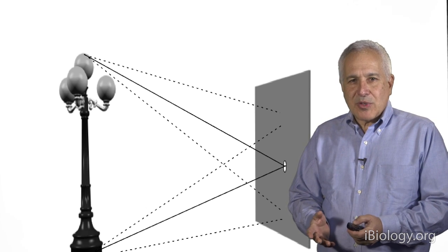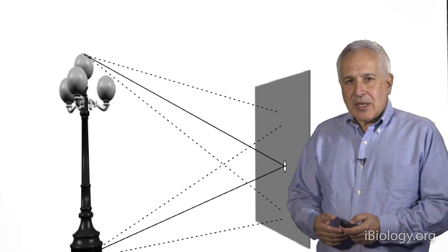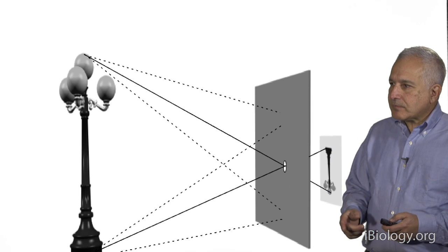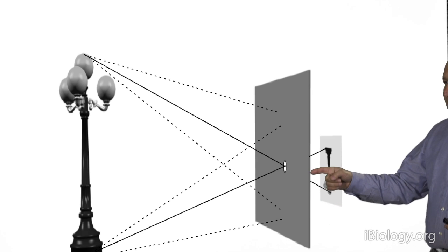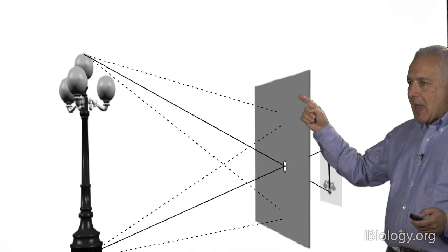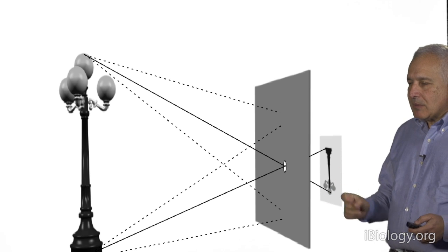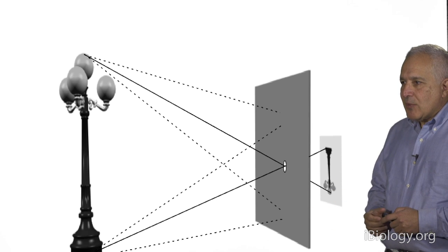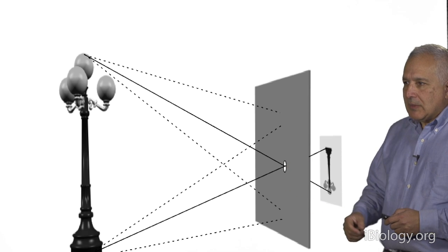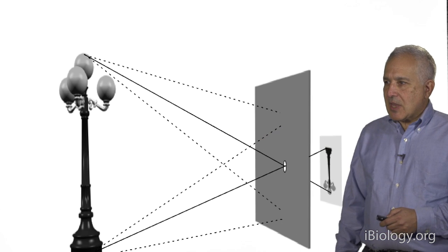The best example of this for imaging is the simplest of all imaging devices, the pinhole camera. I just want to show you a picture of a pinhole camera here. A pinhole camera is a device that has a box, and this box has a pinhole in it, and the box usually has a piece of photographic paper inside. The box is sealed. I've not shown the sides of the box. The photographic paper is looking at the world, and the world is being seen through a single pinhole. In this case, the world consists of a single lamppost shown over on the side of this image.